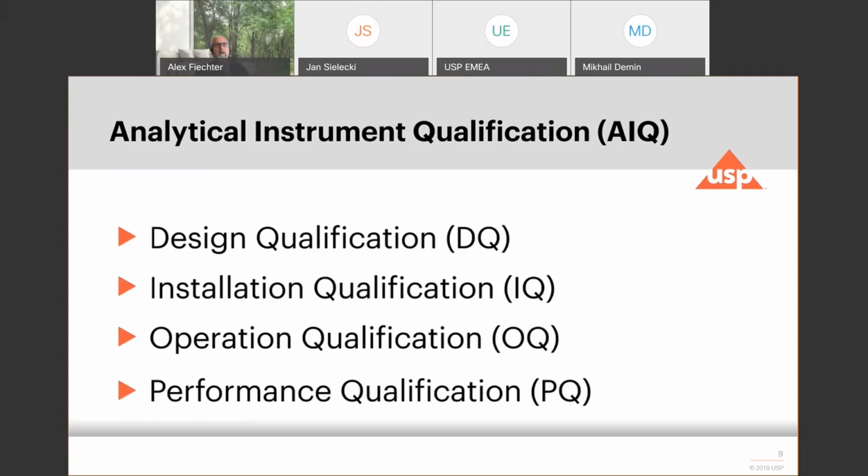Operational qualification is the prerequisite for a performance qualification. Operational qualification, OQ, what you also understand as the mechanical qualification. There are basic requirements coming from the general chapter 711, but ASTM and other guidelines are extending these steps and even narrowing the specifications to what you know from 711.